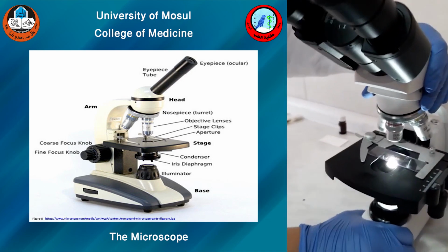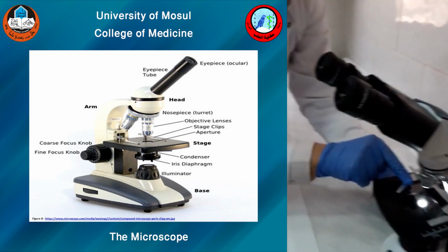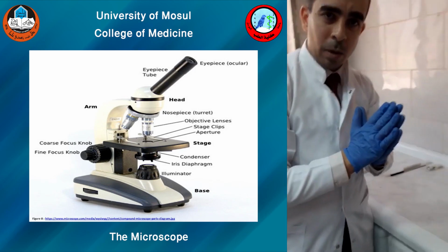Now, most microbiological specimens are placed on a slide that is placed on the stage. So these are the parts of the microscope.